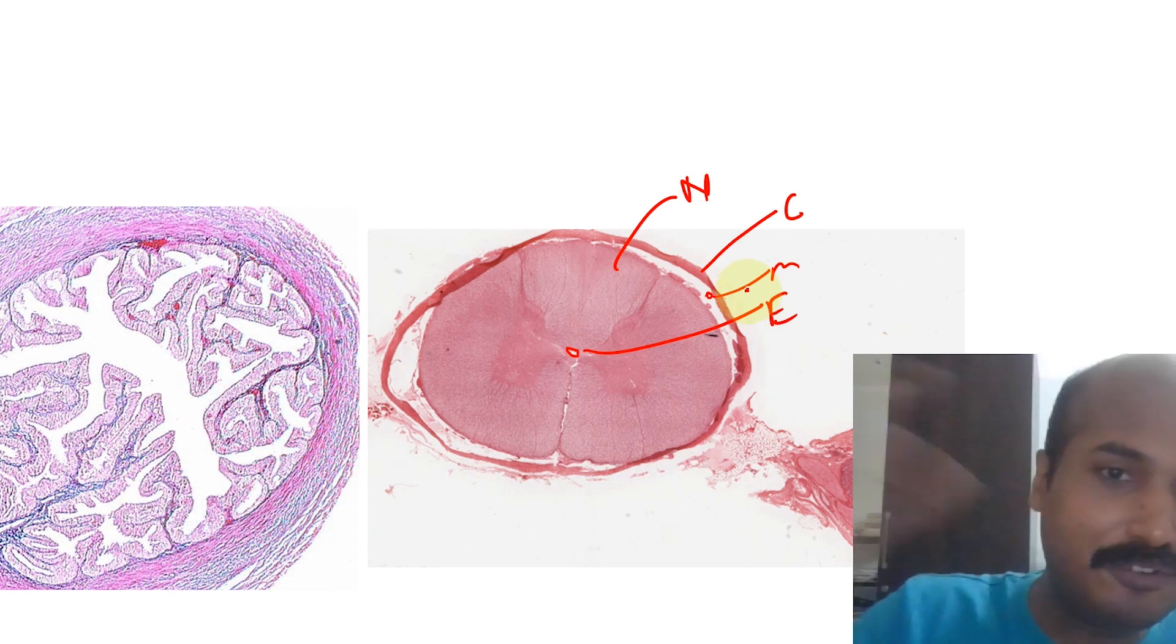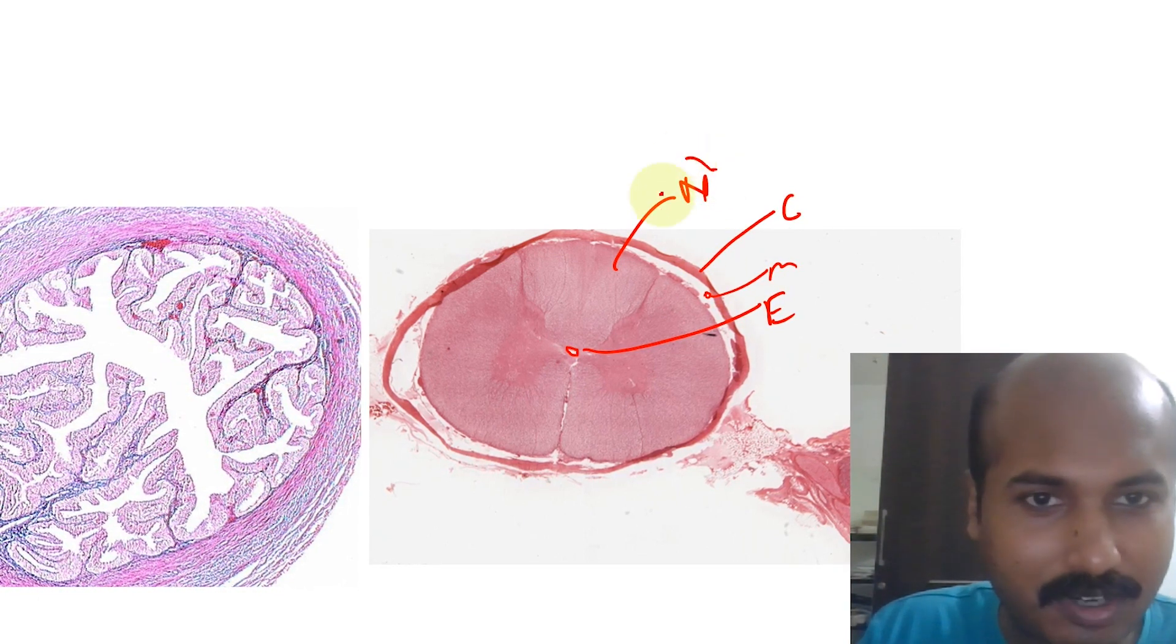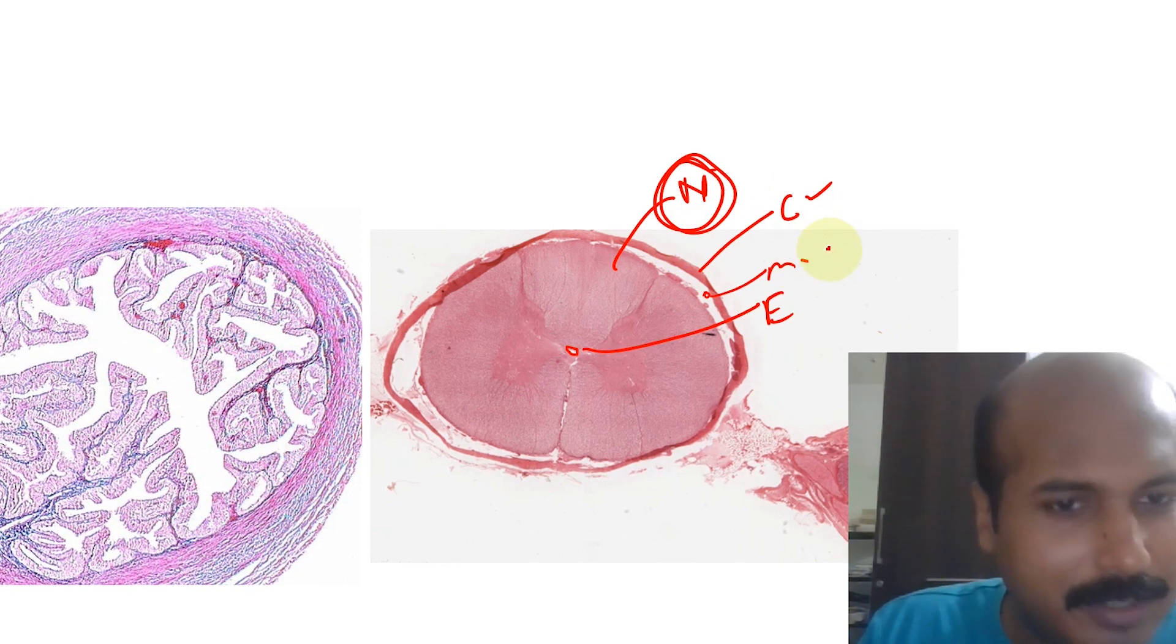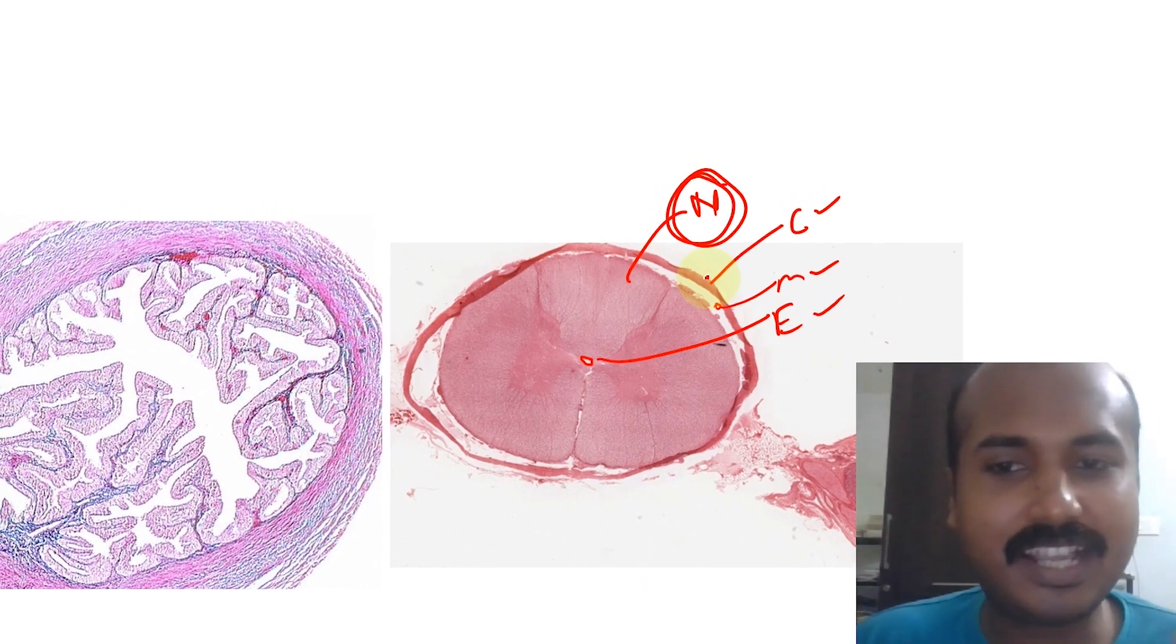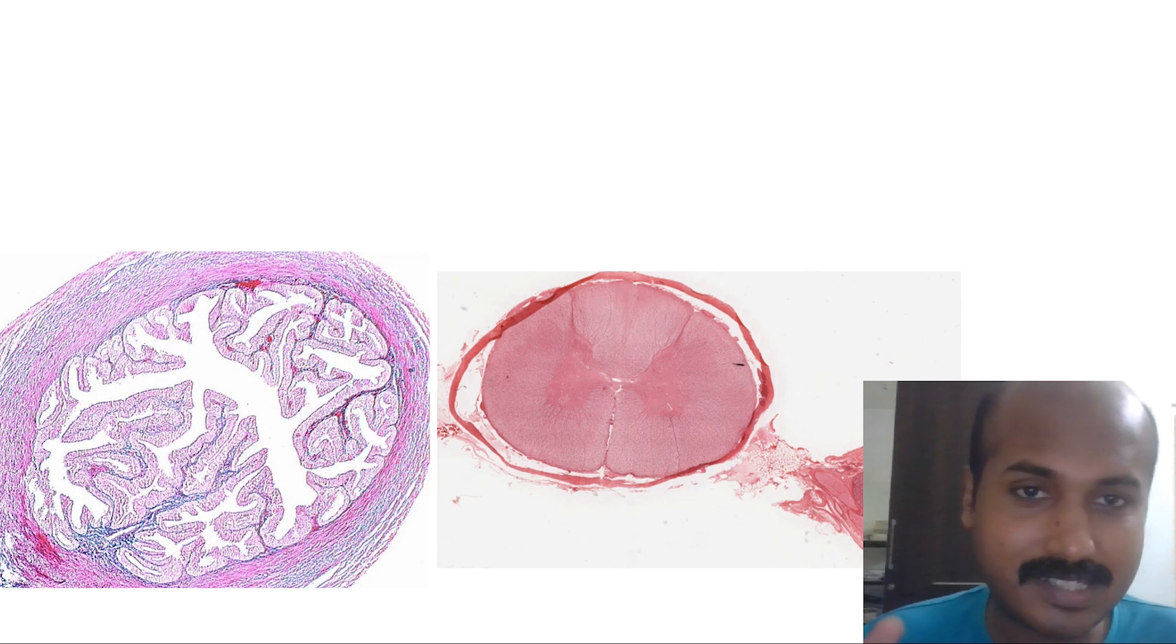So here again you can see a different proportion of different basic tissues. You know spinal cord is mostly nervous tissue, but you also have a little bit of connective tissue, little bit of muscle tissue, and a little bit of epithelial tissue. Basically, any slide you take will have the combinations of these four basic tissues.